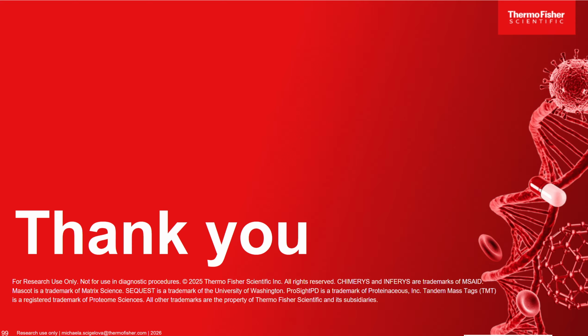You will require specific software, and at present, I believe it's only Proteome Discoverer which can process such data files in one go and give you the results from both types of data in the same report. So that is coming on February the 24th. If that is your cup of tea, please register, and we will see you there.